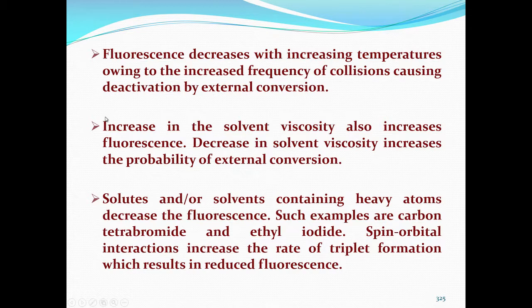Sometimes solvent viscosity, which I have already referred to: the use of polyvinyl alcohol, glycerol, dextrose, maltose etc. increases the viscosity. Viscosity increase means there will be less movement of the molecules. So, a decrease in solvent viscosity increases the probability of external conversion.